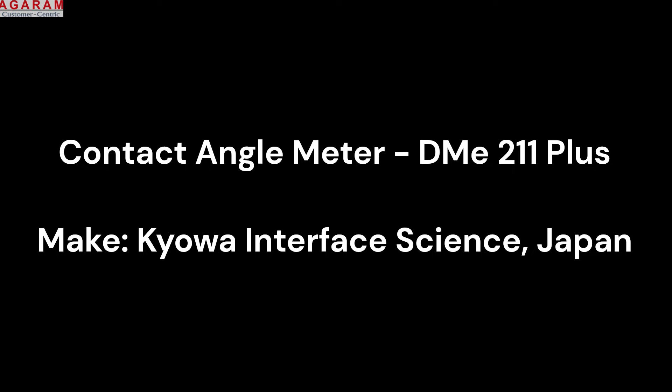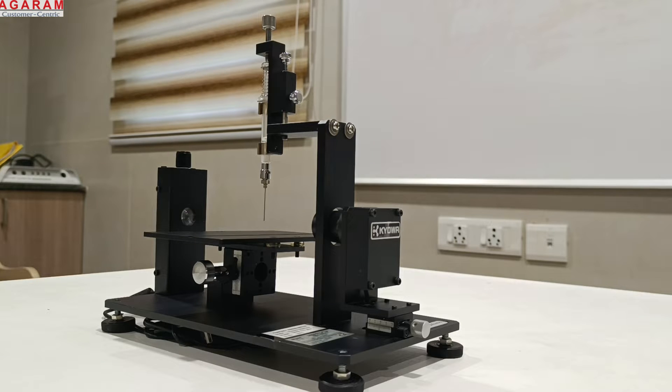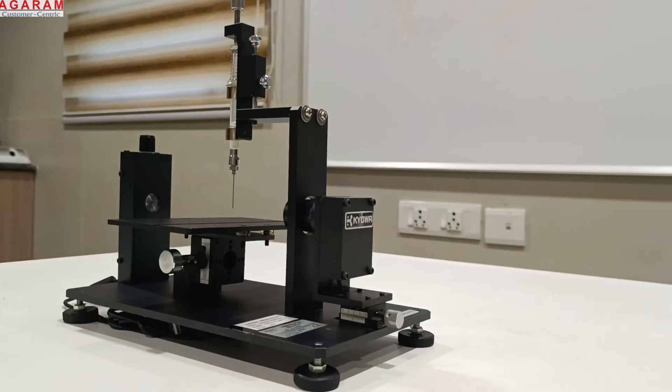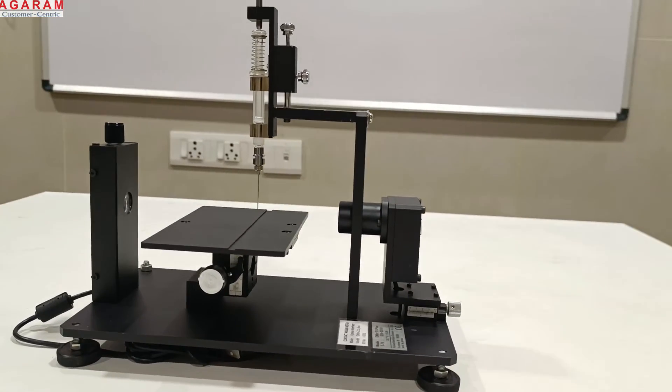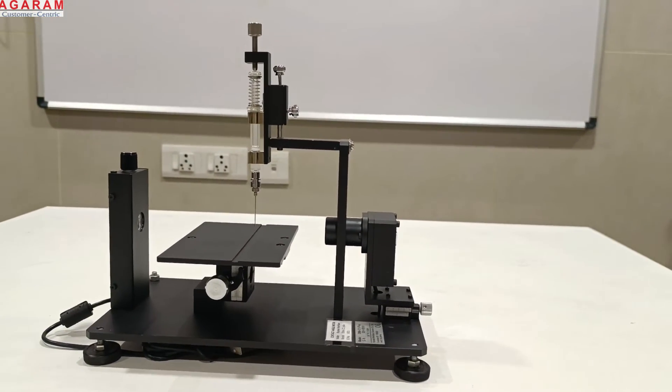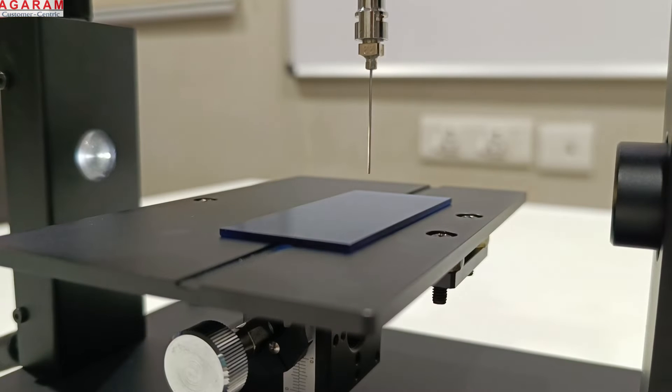Introducing the Contact Angle Meter from Kyowa Interface Science Japan. The model DME211 Plus is a cost-effective and precise instrument designed for measuring contact angle, surface free energy, surface tension, and various other parameters.